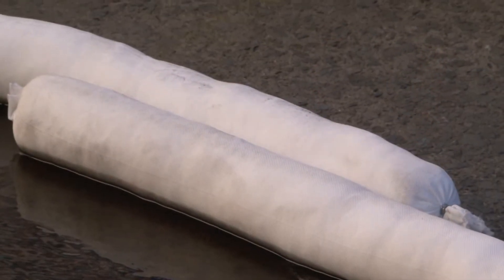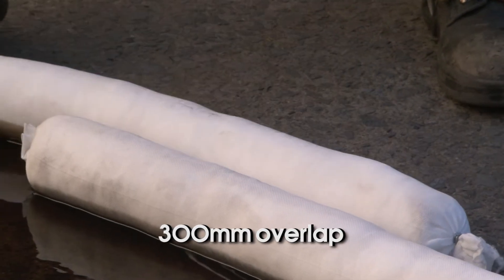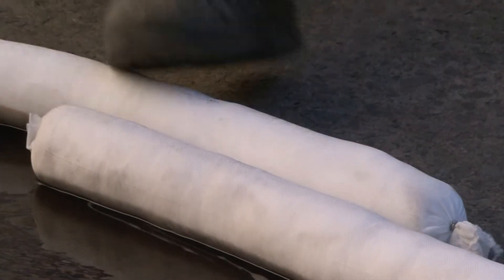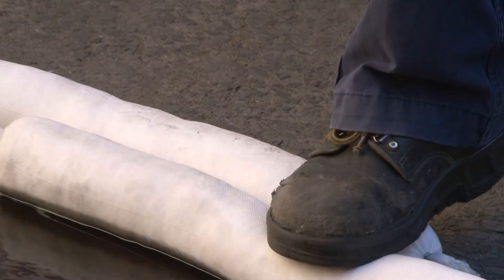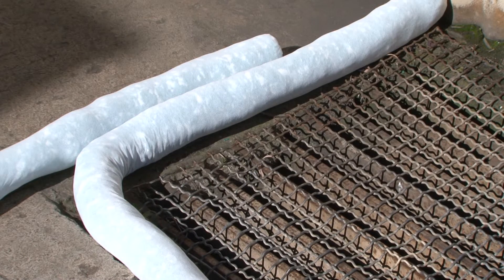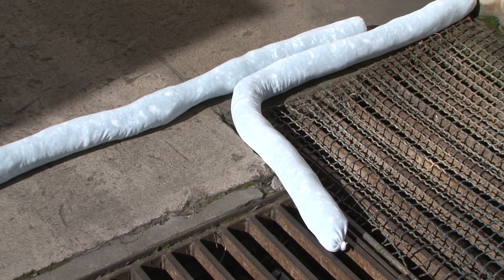If more than one mini-boom is required to contain the spill, overlap each mini-boom by 300mm. Press the mini-boom to the surface firmly to ensure there are no gaps or breaches. Mini-booms can also be used to block drains or divert the direction of a spill away from a drain.